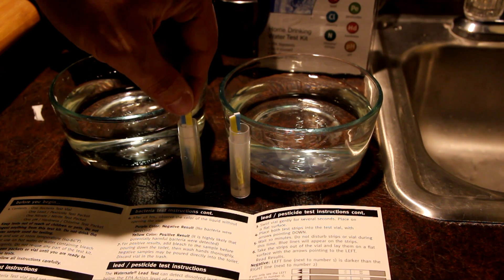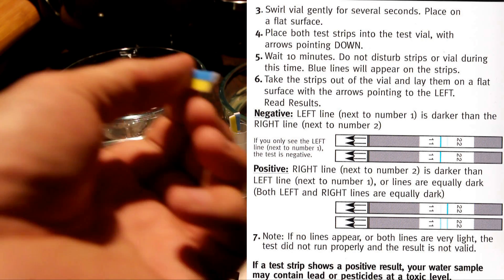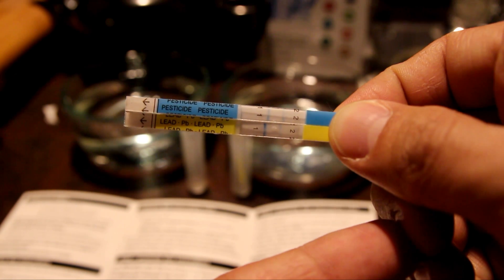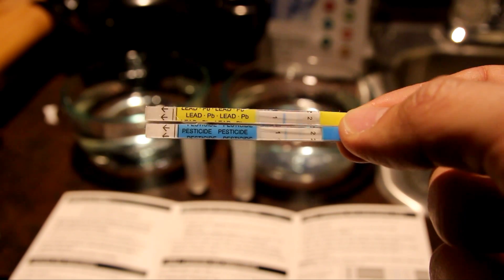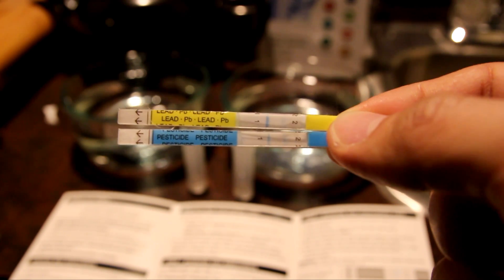It's been 10 minutes, so let's take the lead and pesticide strips out. The yellow strip is at one and the blue strip is also at one for the city water, meaning both are negative — it only reads positive if the line is darker than the reference line. For the reverse osmosis water, it's the same — both strips are on the negative side. So neither water has detectable lead or pesticides.